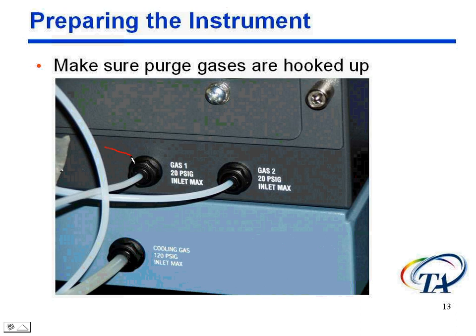One is the gas 1 purge, the second is gas 2 purge, and then we have the cooling gas. Now we're going to talk about cooling gas, or cooling later, and we're also going to talk more about purge gas. But this is where they're hooked up.